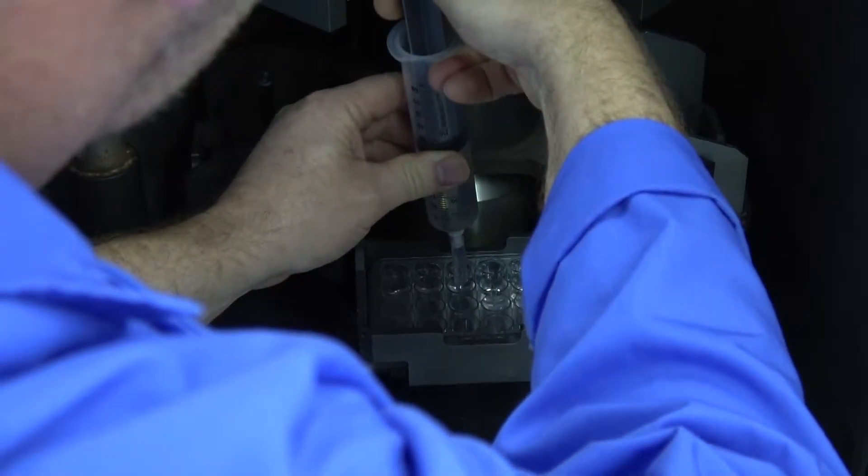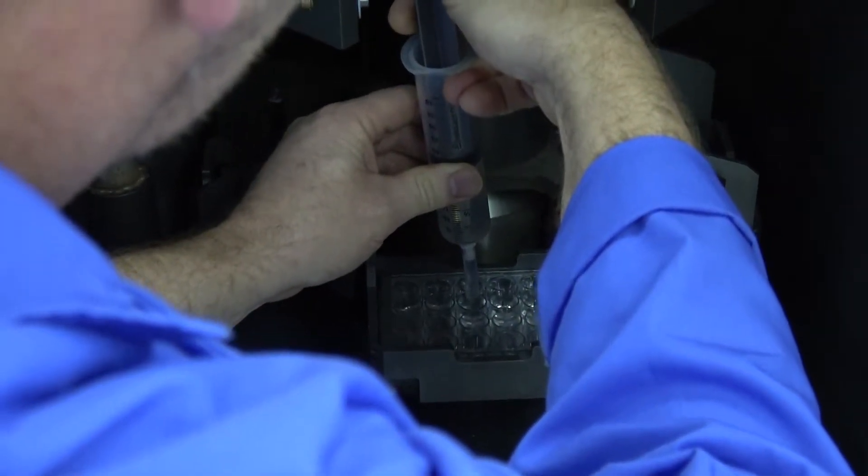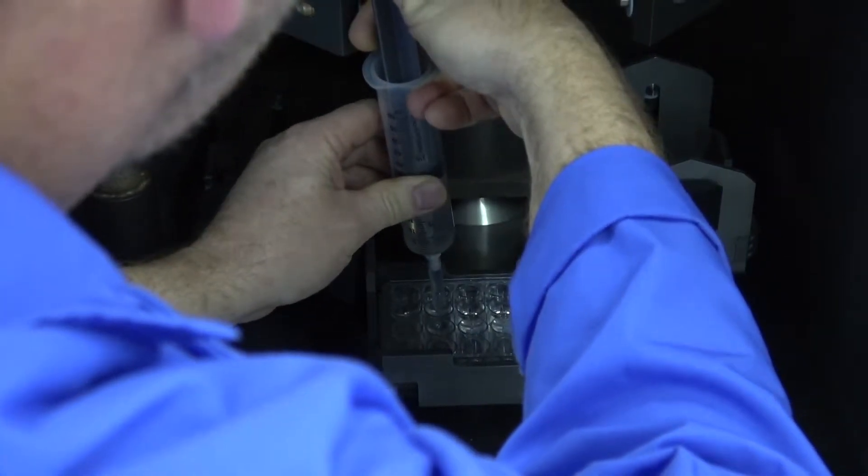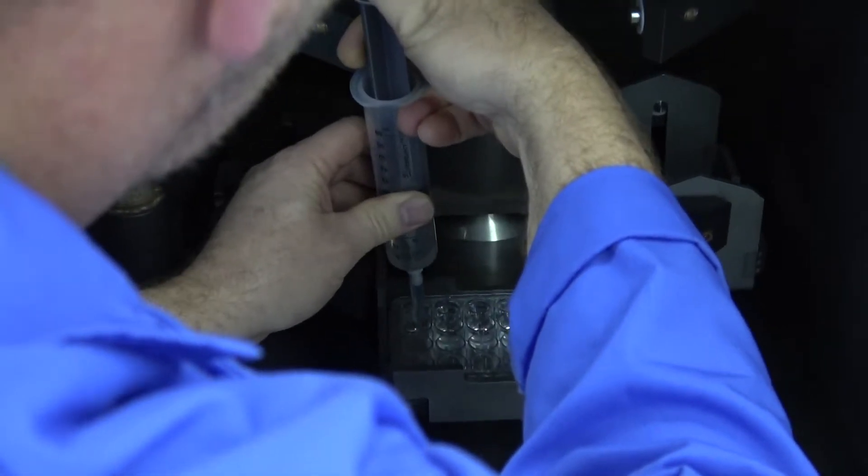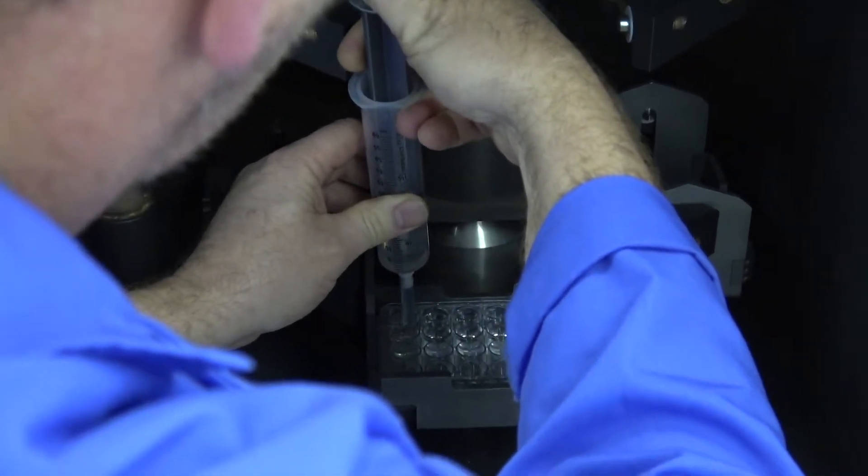You could actually even put inserts in these, and that would hold different kinds of tubes. So there's a lot of options you can do with this.